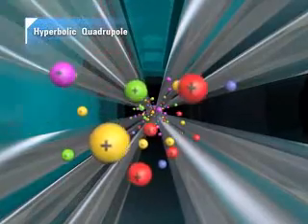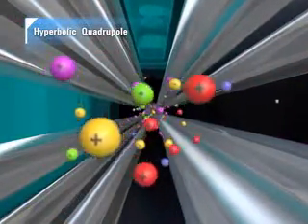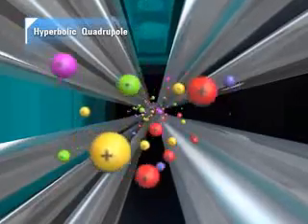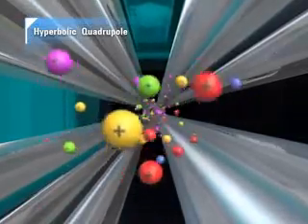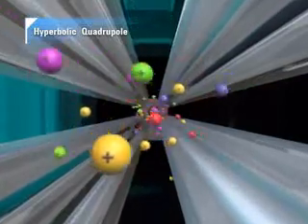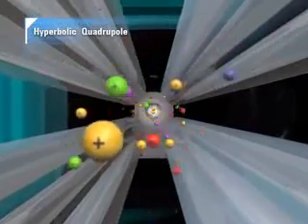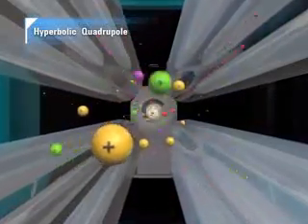The analyte ions leaving the ORS cell enter the quadrupole mass filter and are separated based on their mass-to-charge ratio. Only the target ion is stable and passes along the axis of the quadrupole. The quadrupole scans rapidly across the mass range and passes each mass of interest sequentially to the electron multiplier detector.